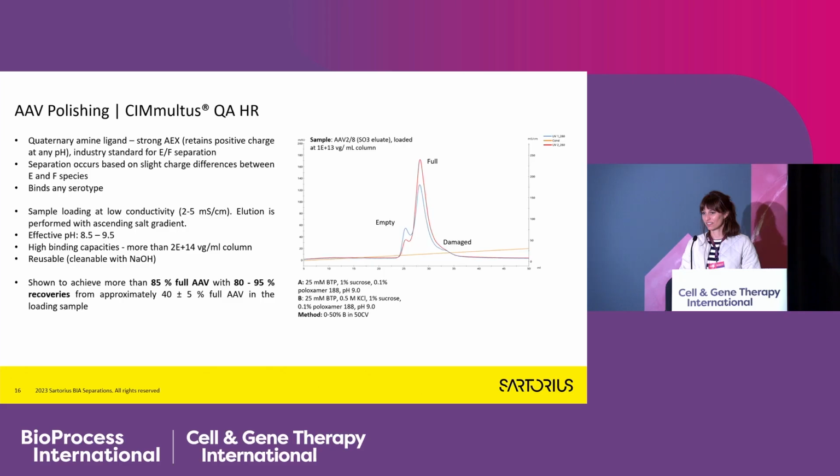Staying with this story, have you characterized that third peak? Do we know that's not something else, like partials? We tested many different analytics, and I don't think we have a story yet for what it is.